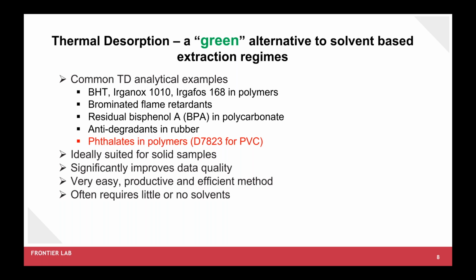This technique is used in other applications and industries, as you can see here. For example, brominated flame retardant and rubber manufacturers also can use this technique. But today we will mainly focus on phthalates in polymers, especially in a PVC type sample.